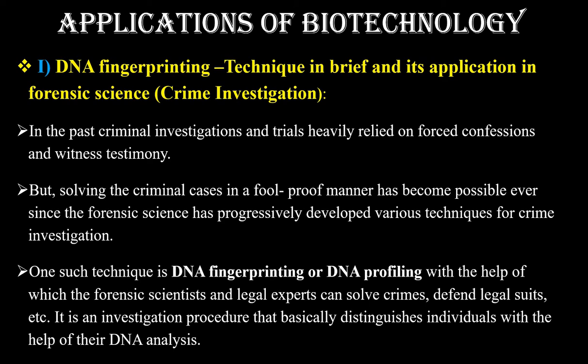In the past, criminal investigations and trials heavily relied upon forced confessions and witness testimony. But solving the criminal cases in foolproof manner has become possible due to the forensic science and its progressive development in various techniques for crime investigation. One such technique is DNA fingerprinting or DNA profiling, with the help of which forensic scientists and legal experts can solve crimes, defend legal suits, etc.